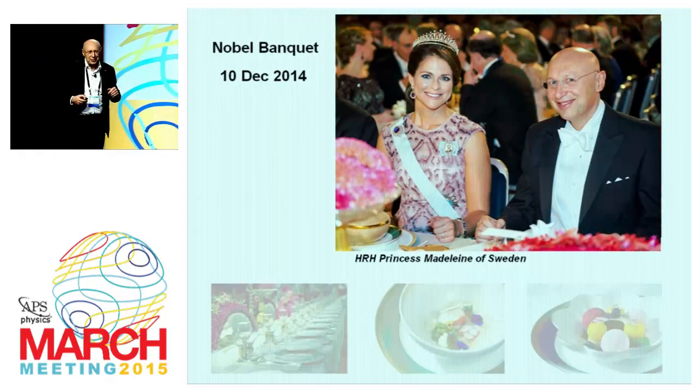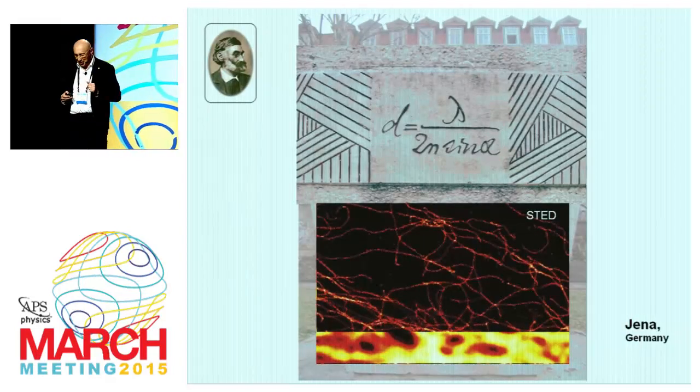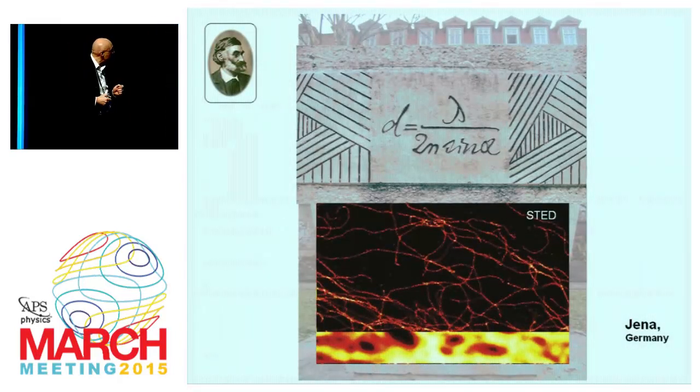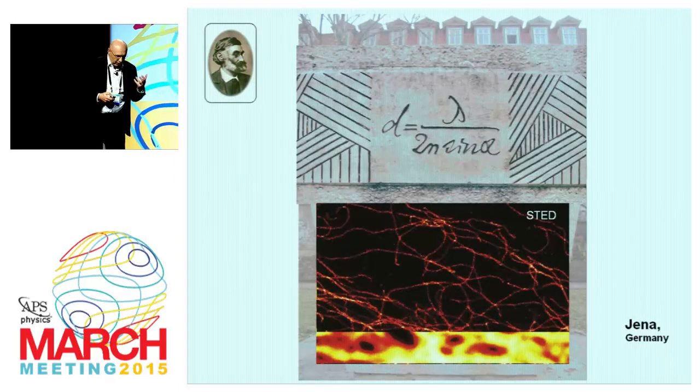But I believe you're not interested in the gossip, you're interested in how it works. Well, I'm going to explain to you how it works. So what actually made the transition here from this diffraction limited image to this high resolution image?